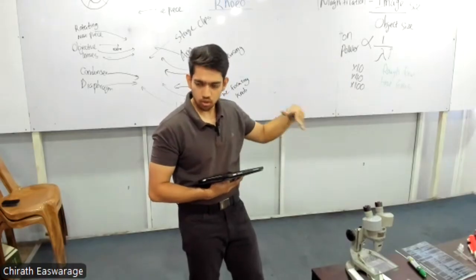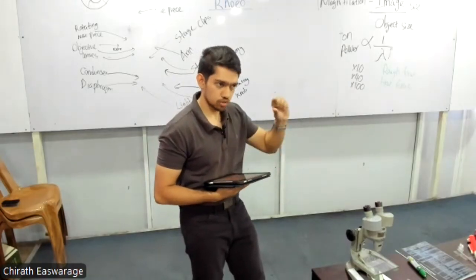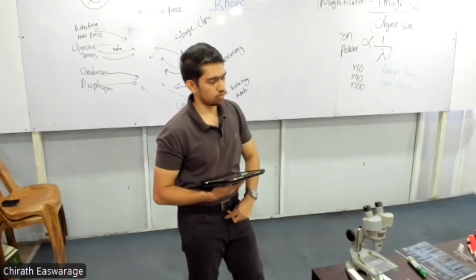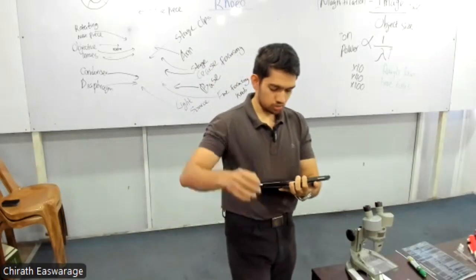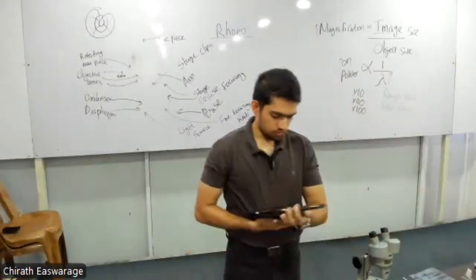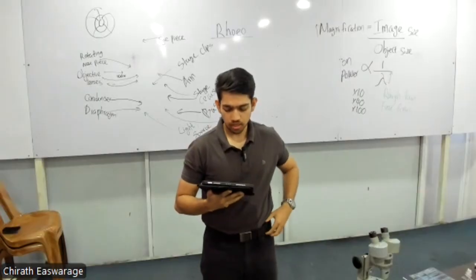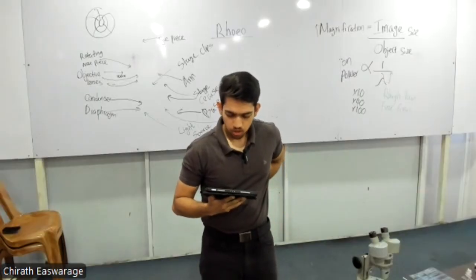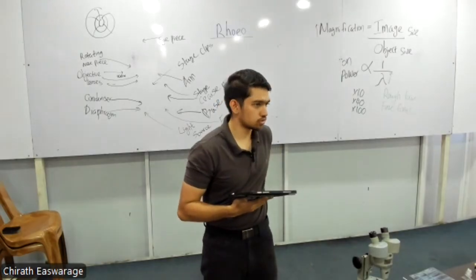So what is the solution? To find a wave type with a smaller wavelength. So the scientists considered the use of other forms of radiation with comparatively shorter wavelengths. As a result, electron microscopes were developed, and in electron microscopy, a beam of electrons is focused onto the specimen or its surface.